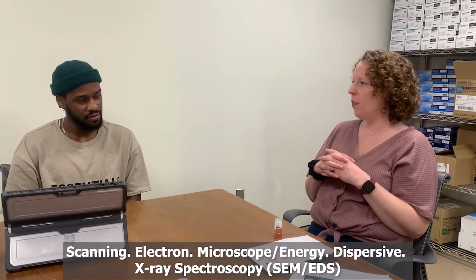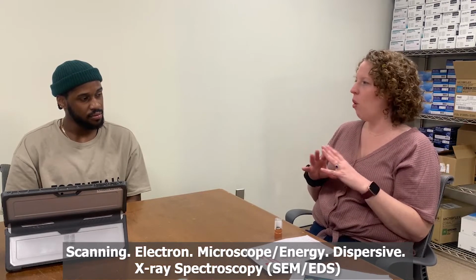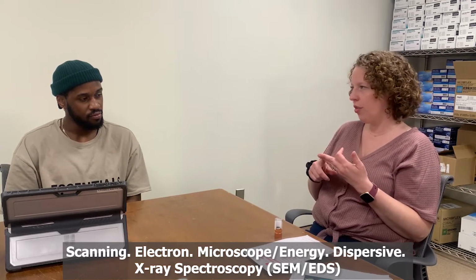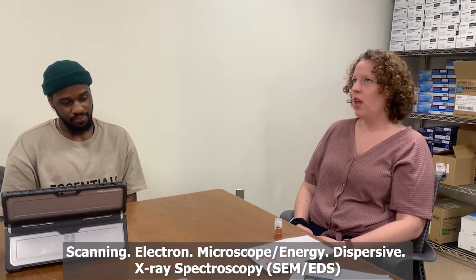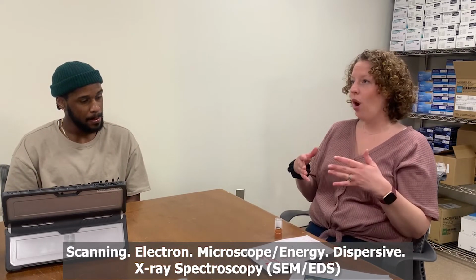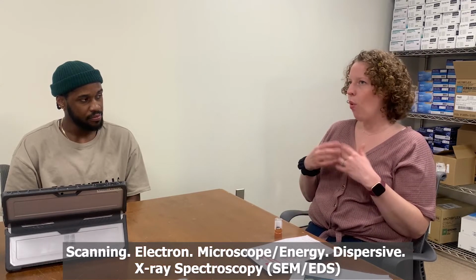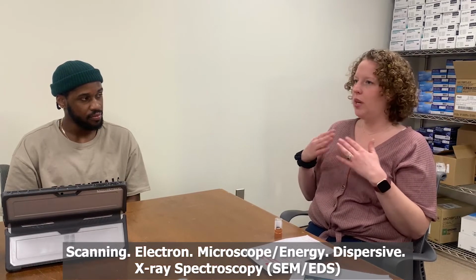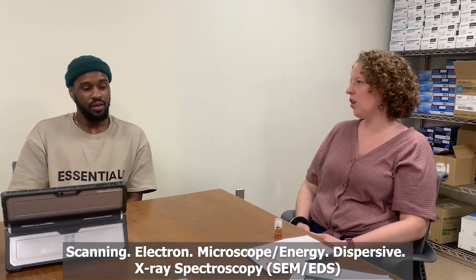The particle itself? Yeah. So a characteristic GSR particle has to be spherical or molten-like, as well as contain lead, barium, and antimony, all three. And that's what's called a characteristic particle. Some labs in America may call something a consistent particle. So if it didn't have lead, they may still report it as a consistent particle. But here at Boston Police, we require all three elements to call something a GSR particle.